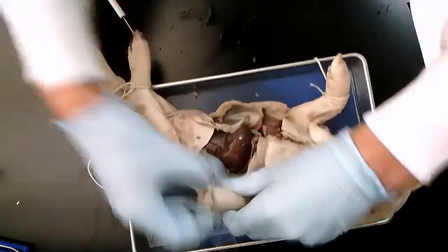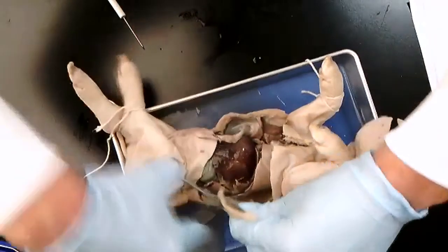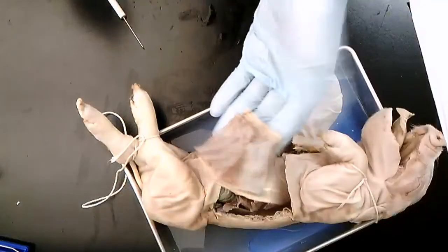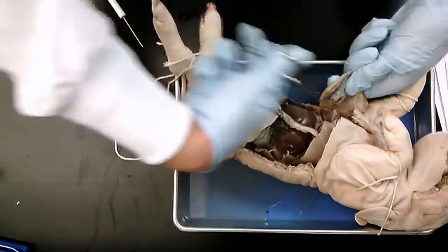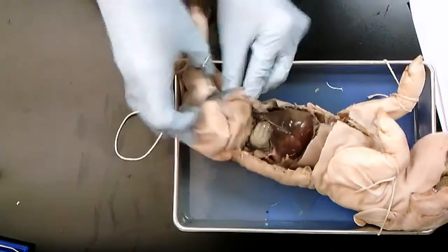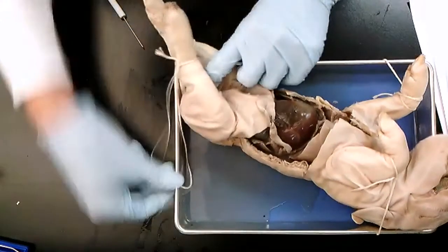So my recommendation is, just for ease of getting into the organs, I just take the scissors, cut through the ribs, and then have that left over. That way you're going to see the organs better. I do that on both sides. That is totally up to you on how you want to teach your students. The challenge with the string is if you don't get it tight enough around the dissection tray, it comes off.